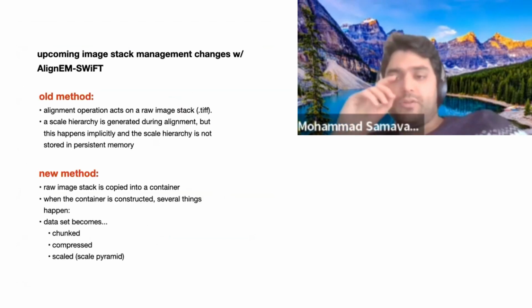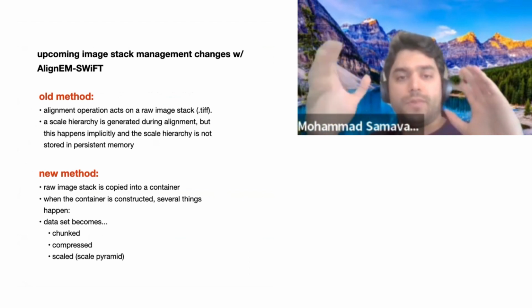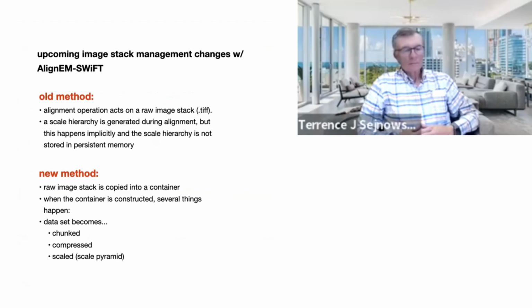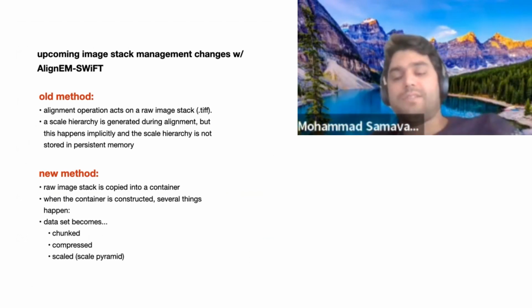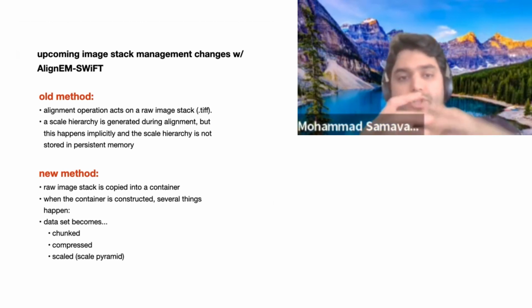So Joel, a quick question for Joel and Tom. I noticed how this new effort is going to help the Reconstruct Plus, and also change the older Reconstruct. How much are you changing NeuroGlancer, or what aspect of NeuroGlancer do you want to tweak or improve?